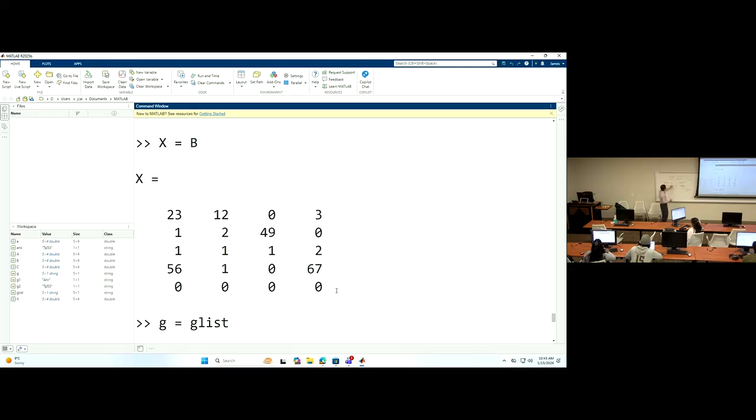So we will process data, go through Cell Ranger using a real data example. We will get a gene expression matrix, the files. This will create X. What is X? It's the expression matrix, and a G, a list of genes. So these two things will be what we need to give to this tool to do downstream analysis. Okay?